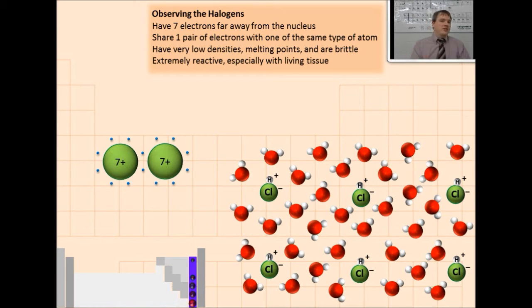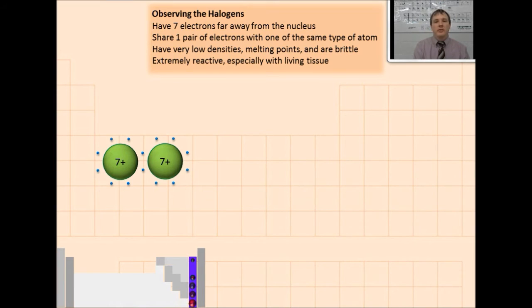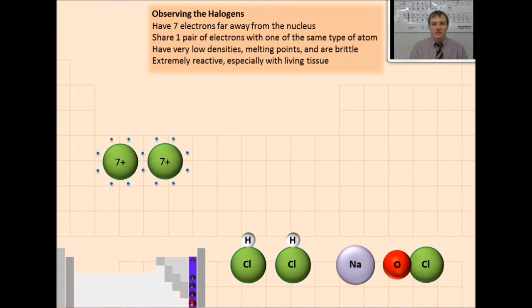It's corrosive. Hydrochloric acid is something that's much more difficult to purchase. Science teachers have access to this. I don't recommend that anybody else really have access to this unless you need it for some job that you're doing with chemicals or chemistry. When you mix these substances together, a very dangerous chemical reaction happens. Let's take a look at just the atoms and molecules that are involved in this reaction. We're going to react hydrogen chloride in the hydrochloric acid with sodium hypochlorite.